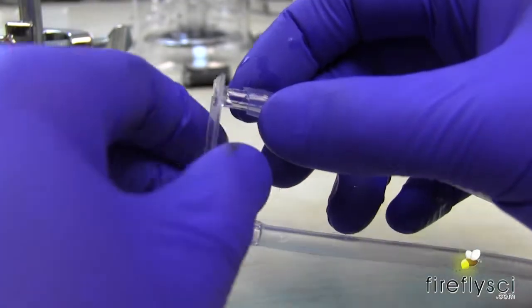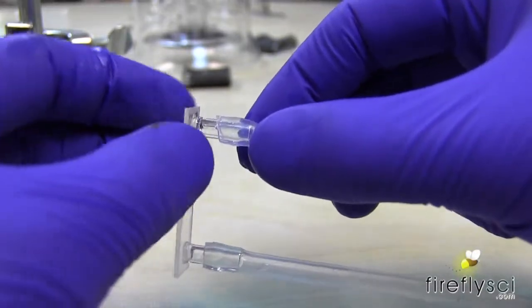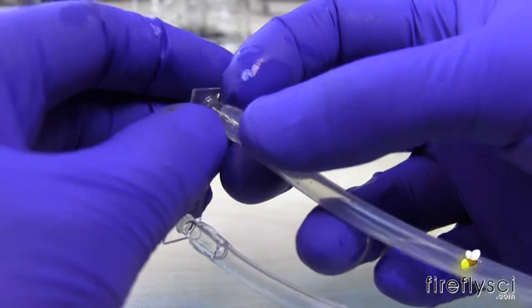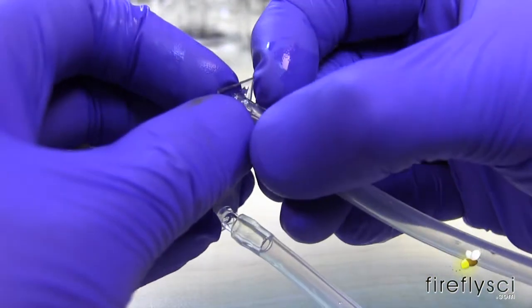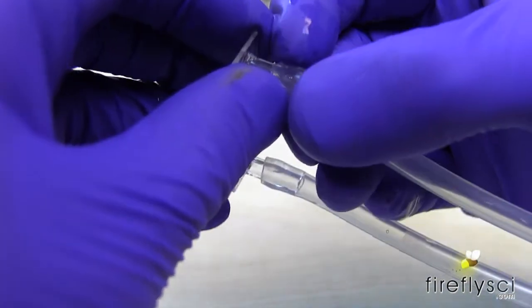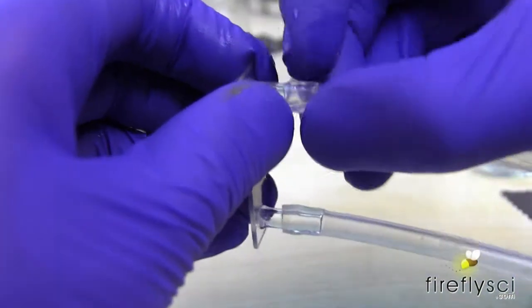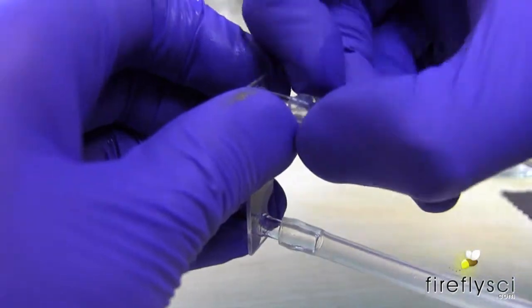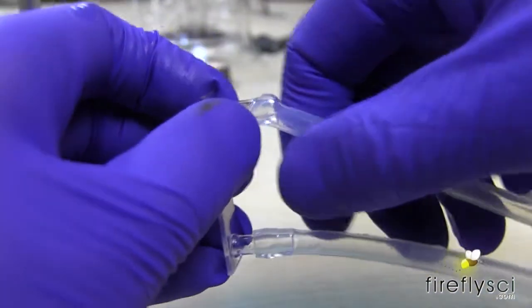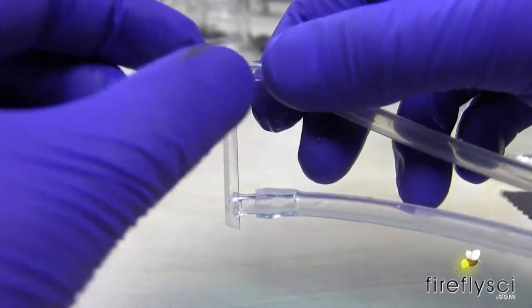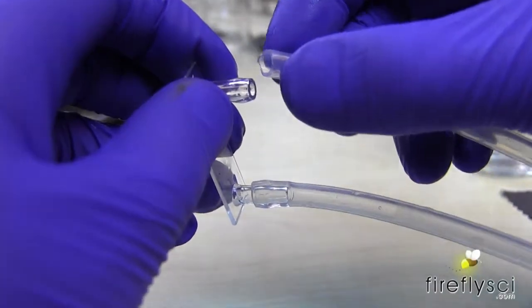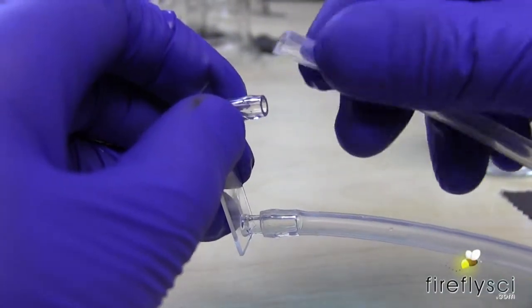I just wanted to make one note about removing the tubing from the connectors here and you want to pull it off one side of the tube at a time rather than pulling it straight off because you could snap this completely off. If you pull like directly out like this you are going to break this here. So you pull off one piece one side at a time and it will come off really easily.